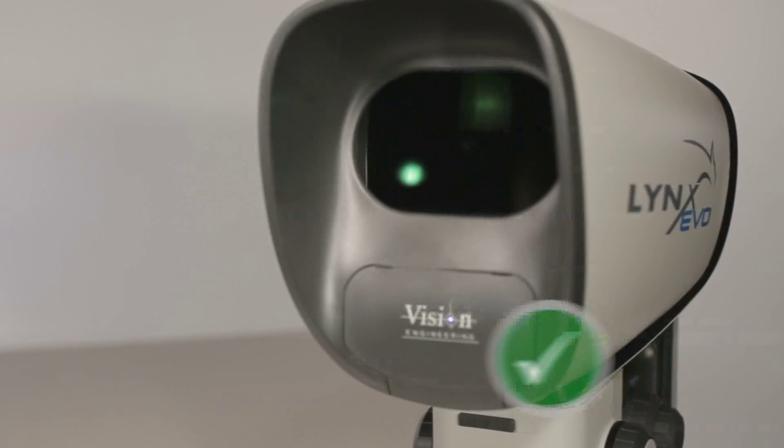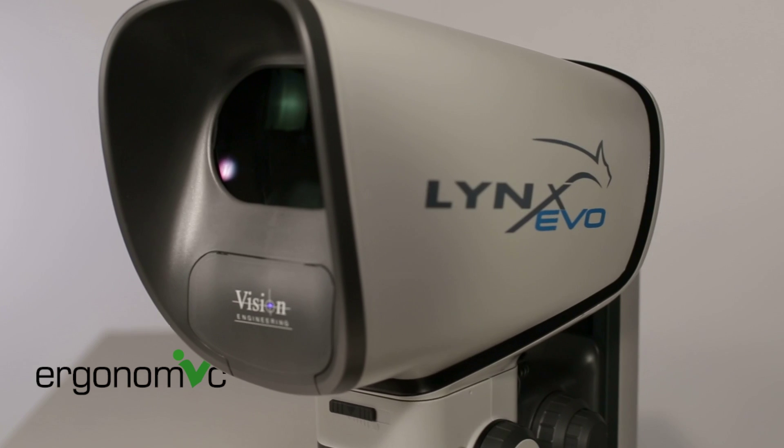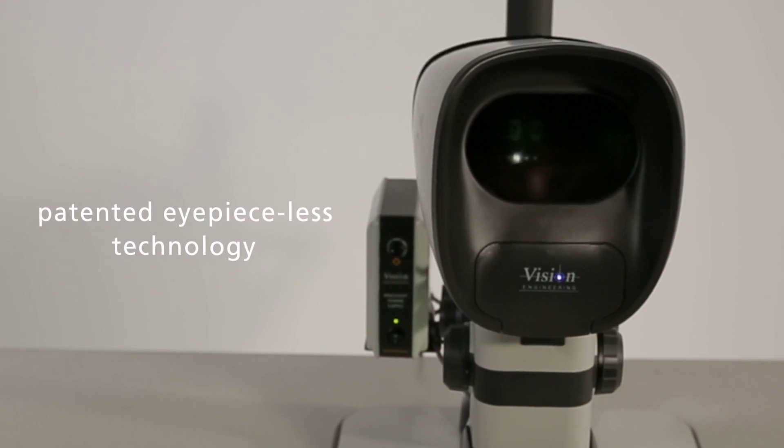Introducing Lynx Evo, a high productivity ergonomic stereo microscope without eyepieces.